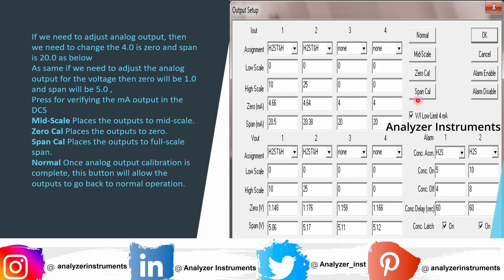The last step is Span Cal. Once you press Span Cal, the output will be at full scale — the DCS will read 10 ppm and the multimeter will show 20 milliamps. This also applies to the voltage output accordingly. Based on these readings, we can verify and adjust the 4-to-20 milliamp analog output. If there is any drift in the analog output, we can adjust it from here.